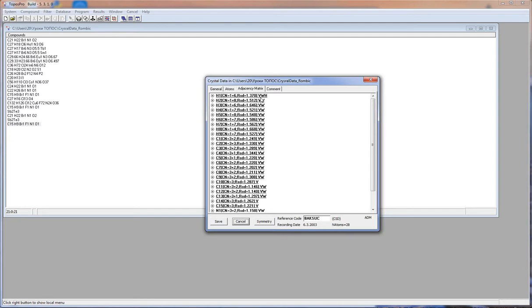The letter V means valence, double V, van der Waals, and H, hydrogen bonds. We can expand the list and see the full information. Here, solid angle, bond length, valence stress, and bond multiplicity are indicated. Valence bonds are shown in bold, hydrogen in blue, specific in red.